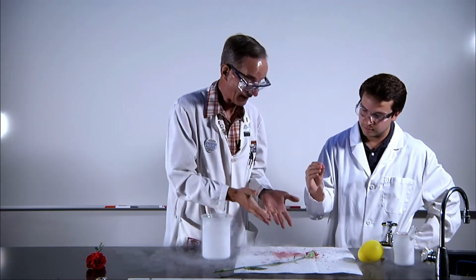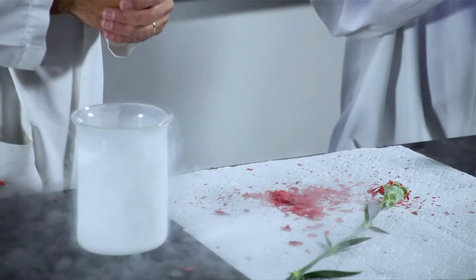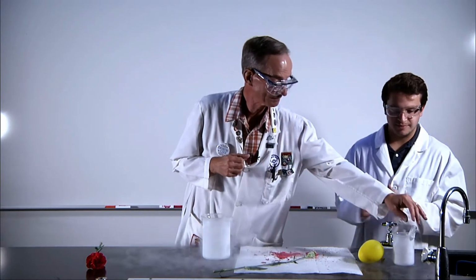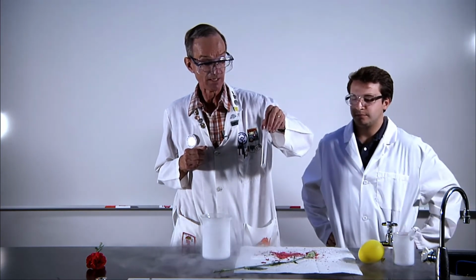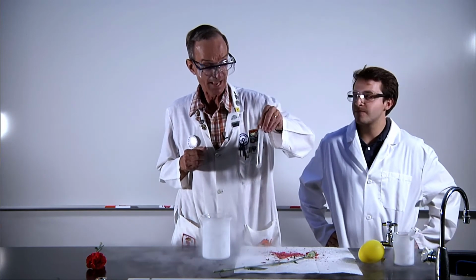All right, and of course, what's going to happen, since we have these little parts, it's going to thaw out really quickly, and we'll have a bunch of kind of moist, limp flower petals there. Now I'm going to take one of these test tubes out. This might be a little harder to see, but we have some liquid in there. So what it has done, it's distilled some of the, condensed some of the oxygen out of the air.